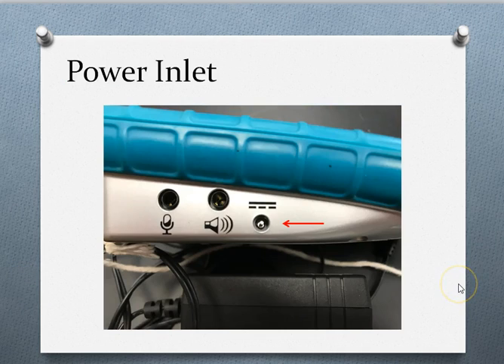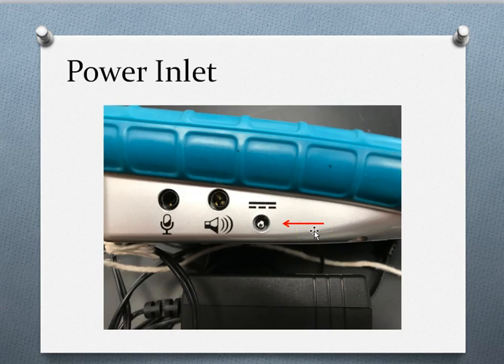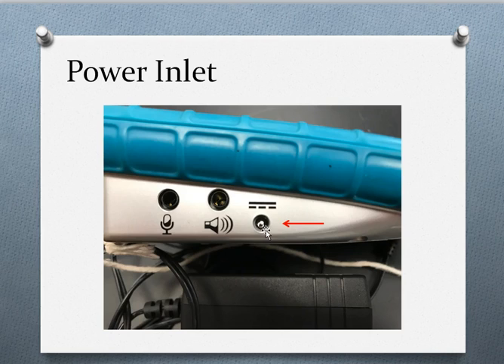First and foremost, you're going to hook up the power cord to one of the outlets in the lab desk, and then take the other end and hook it up to the LabQuest. When you look on the side of the LabQuest, there is a series of ports — one is the microphone, one would be for headphones, and the power cord port is this one right here. Notice the arrow pointing to it. One end goes into the outlet in the lab desk, and the small end goes into the LabQuest.